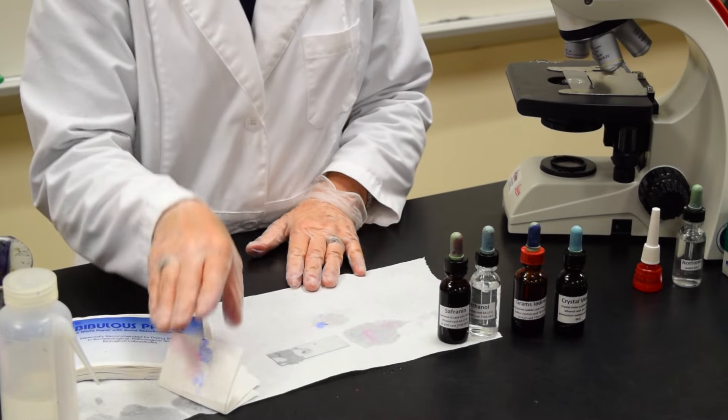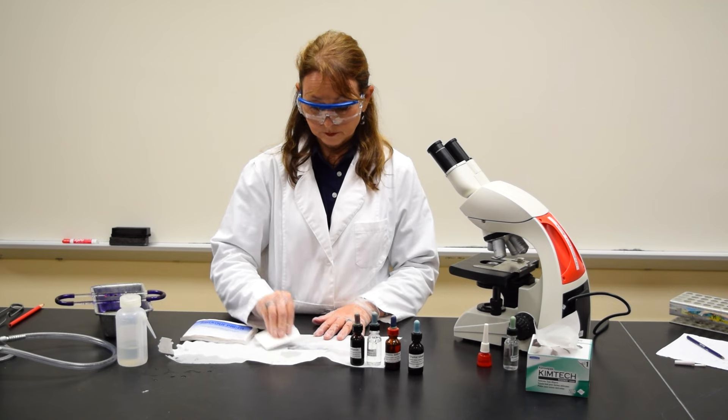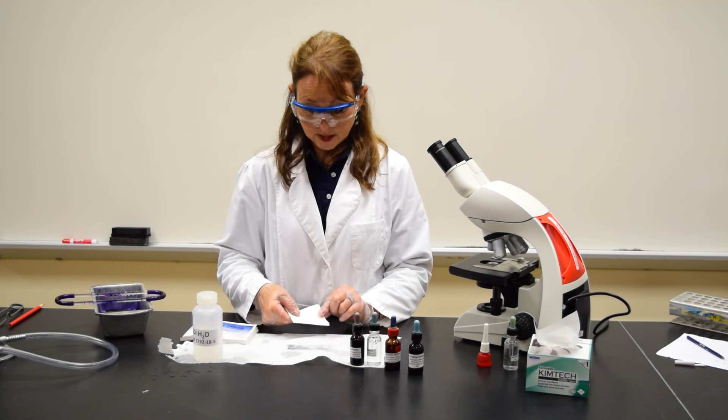Place the slide on paper toweling. Take your bibulous paper and gently blot dry. You rinse after every reagent that you add, and you blot dry at the end.